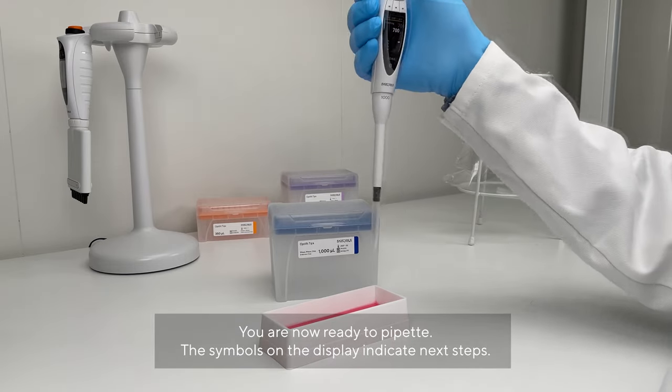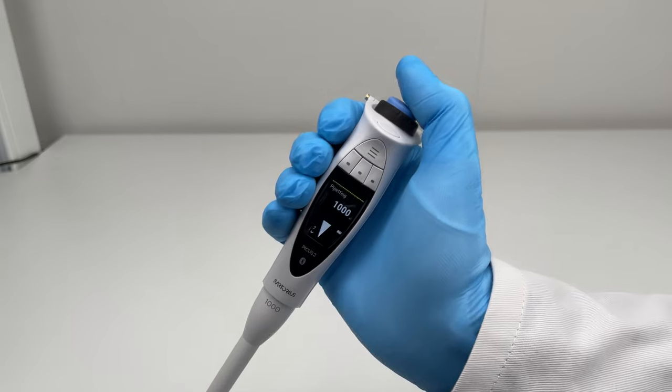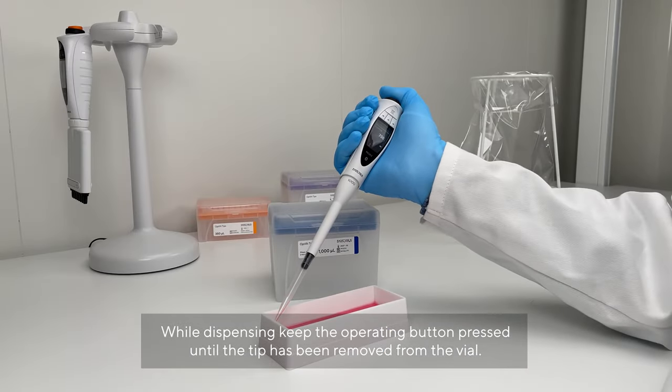You're now ready to pipet. The symbols on the display indicate next steps. While dispensing, keep the operating button pressed until the tip has been removed from the vial.